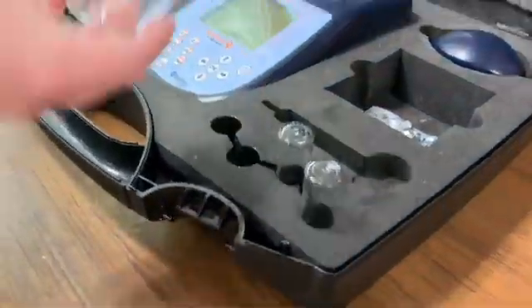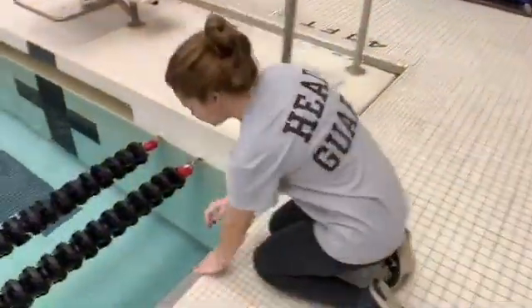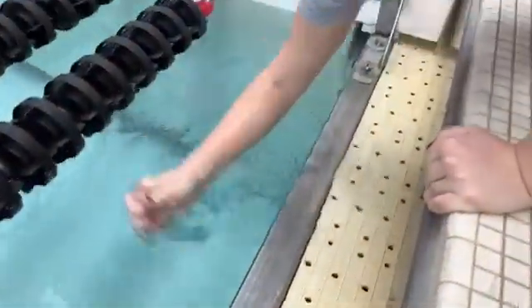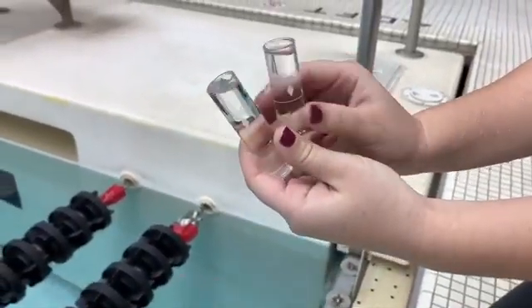We will take two tubes for each pool. Once you have your two tubes, you will then kneel down next to the water. Reach your arm all the way in down to the elbow. Once you have your water, you will then flick out until you reach the 10 milliliter marks.